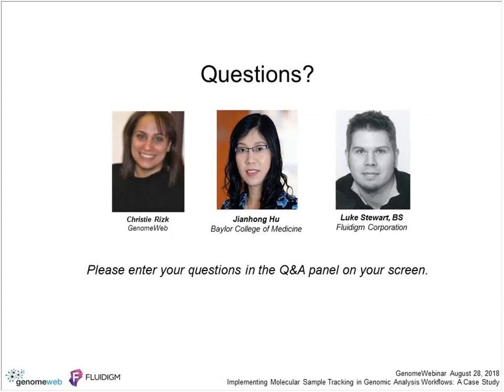Jianhong, the first question is for you. What are some of the most frequent sample failure modes? And is it sample duplication, sample swaps, or is it something else? I think the most frequent failure mode in our production is sample contamination. That will cause either the wrong call of the gender, because a call is made that is not supposed to be, or the contamination causes a low overall QC call rate and it causes the sample to fail.